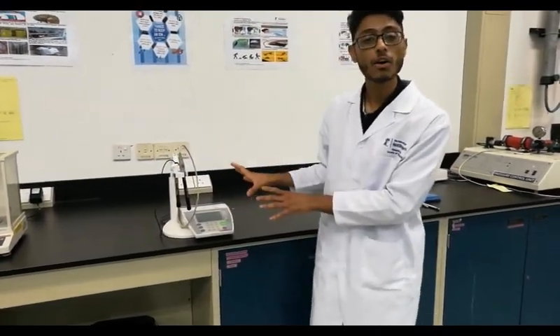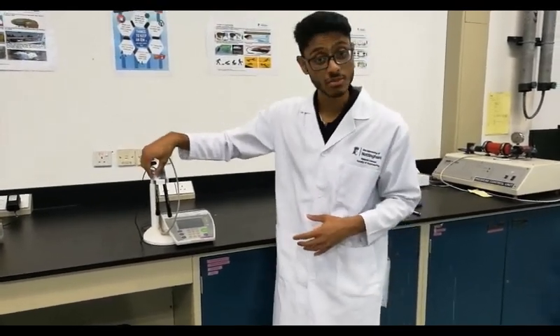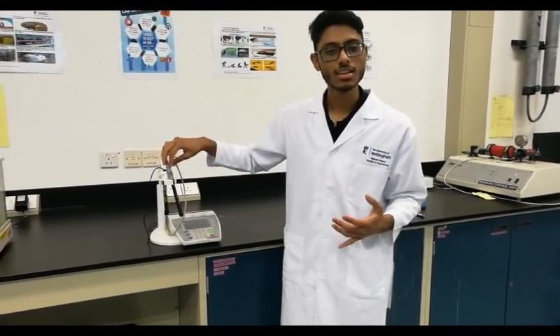Now, each of these parts of the equipment have different roles to play. Let's start from the ion selective electrode. The ion selective electrode helps us to measure or calibrate during the experiment. And it also helps us to measure the fluoride ion concentration during the experiment for the different samples. The conductivity sensor, as the name suggests, helps us to measure the conductivity of the different samples at different temperatures. Finally, the display helps us to obtain the values or the numbers for the concentration using the ion selective electrode and the conductivity of the sample liquid using the conductivity sensor.